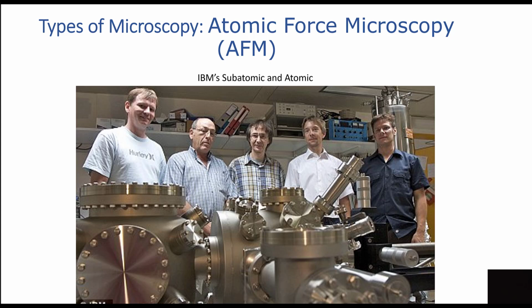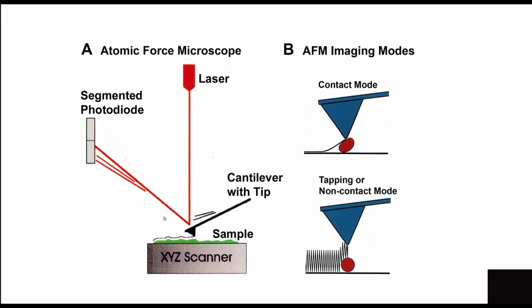This was actually developed by IBM about 9 years ago, right here in RTP. And using this type of scope, which costs about $3-4 million at the time. This is the Skunk Works that produced such a wonderful device. And how it works is you have a cantilever that's attached to this little probe, sticky thing that sticks out, and that's about 1 angstrom thick.